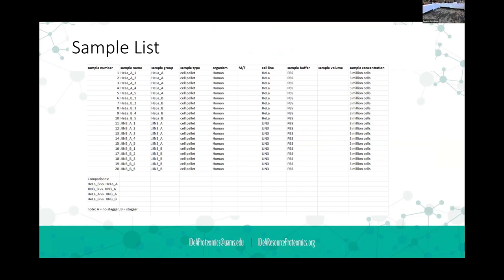Sometimes you guys, I say you, I'm just lumping all of the PIs in the world together. You will have these really complicated, it's like a certain cell type with a certain condition with a mutant in there. And so you've got these names that are like 48 characters long with all of these special characters in there and all that kind of stuff. And you're doing that, right?